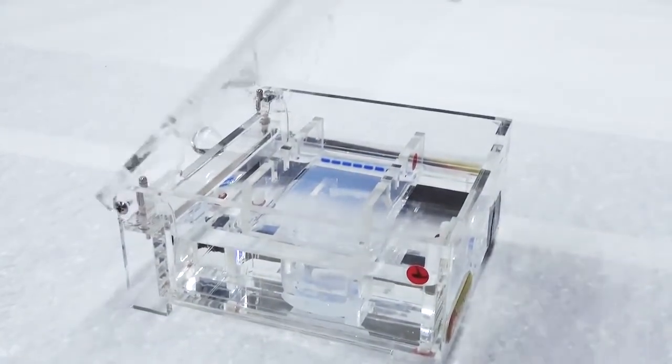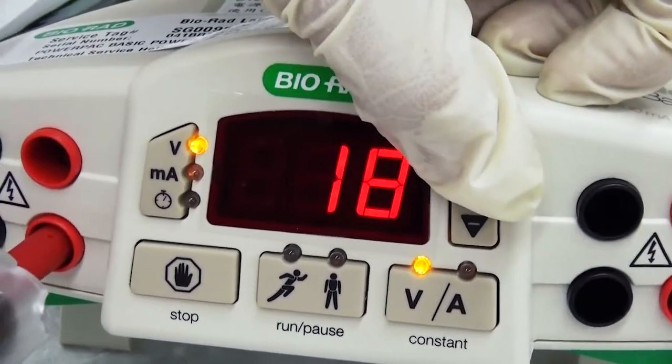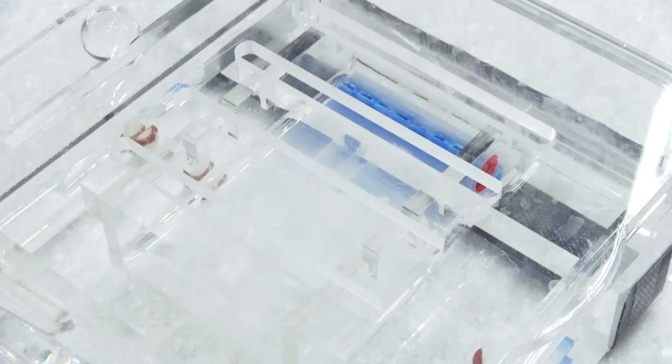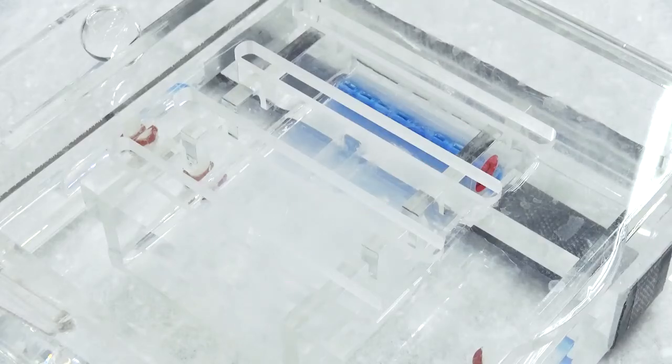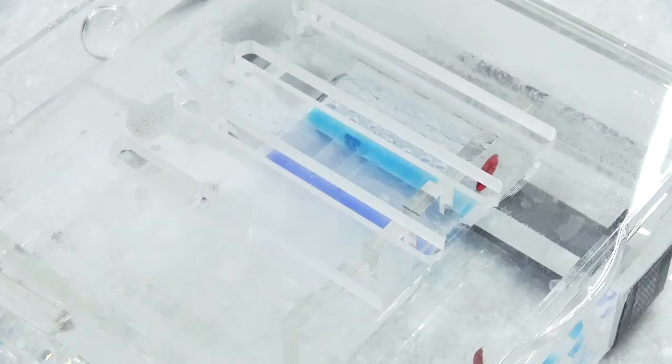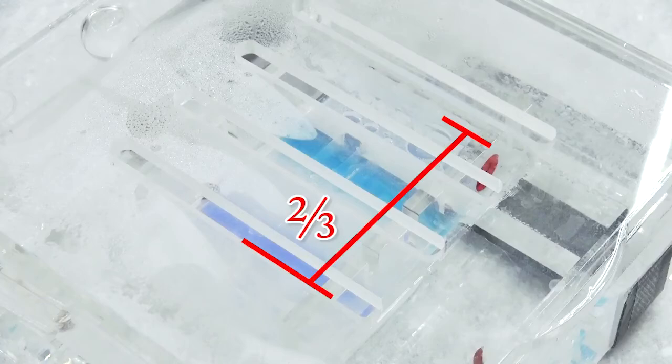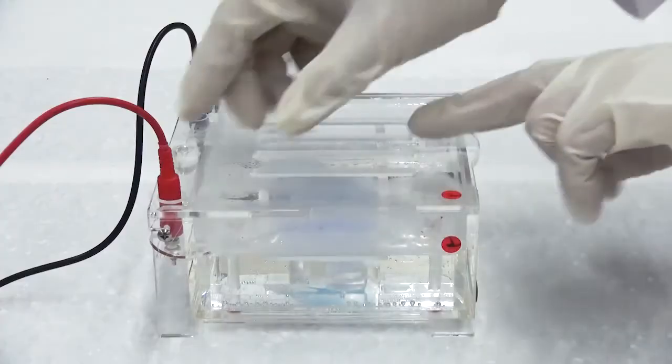Attach the lid and power cords, black to black and red to red. Set the machine to run at 100 volts. Watch for bubbles to appear around the electrode and make sure the tracking dye moves toward the positive electrode. After about an hour, when the tracking dye has moved two-thirds the distance of the gel, switch off the power and remove the power cords.